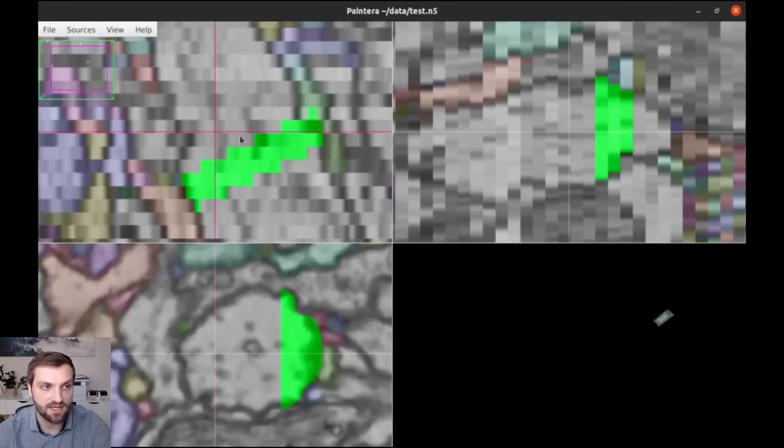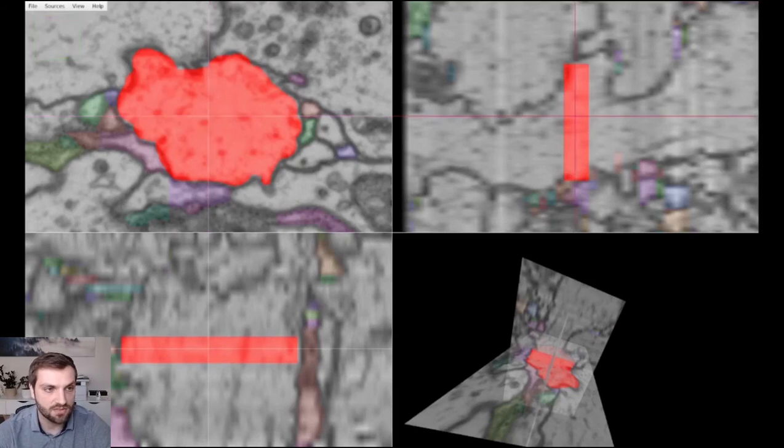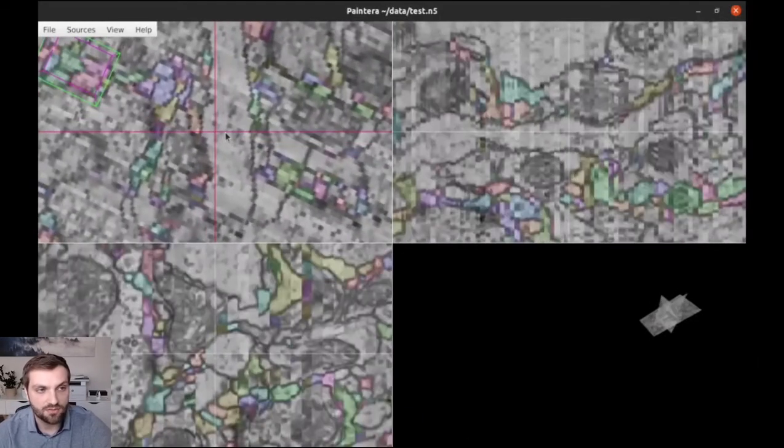Then we can go back into the data's orientation, and you can see that that is in fact an axis not aligned with the data. Okay, so now we're going to look at another neuron, and what we're going to do is a quick skeleton outline of this slice. And this is to emphasize the fill tool. So there's a fill tool that allows you to fill in internal slices that you've skeletoned out.